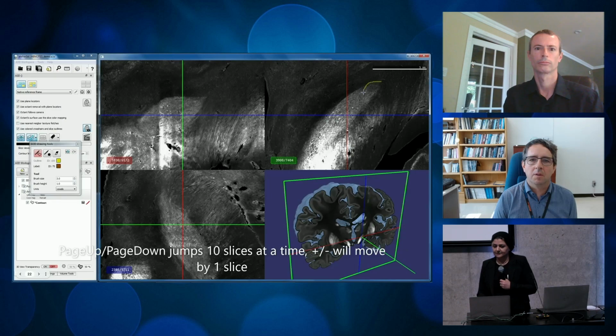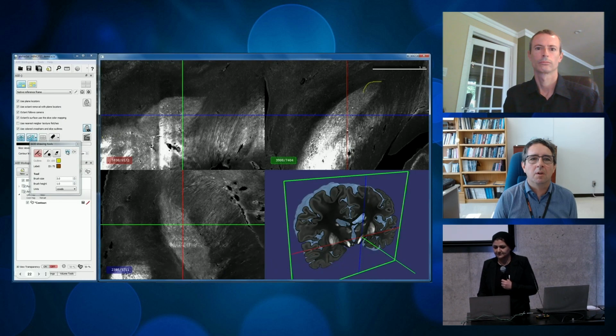As you see, we have the ability to redo or erase if we make a mistake. And we do the painting for every other slice.